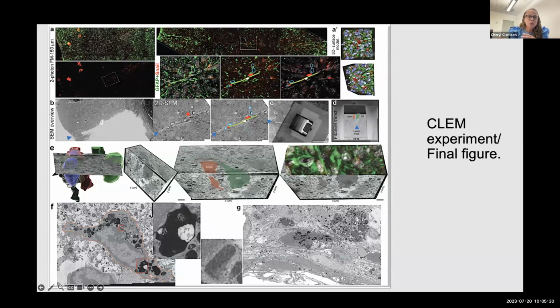And at the end, I'm just showing at the top how the cells really look, and I'm showing the ultrastructural difference. You can see here that I have even mitochondria, and all this is after I ran regular immunofluorescence, even with antigen retrieval, so by heat.